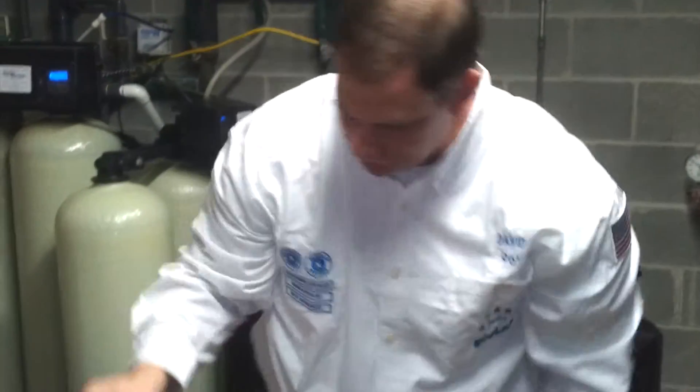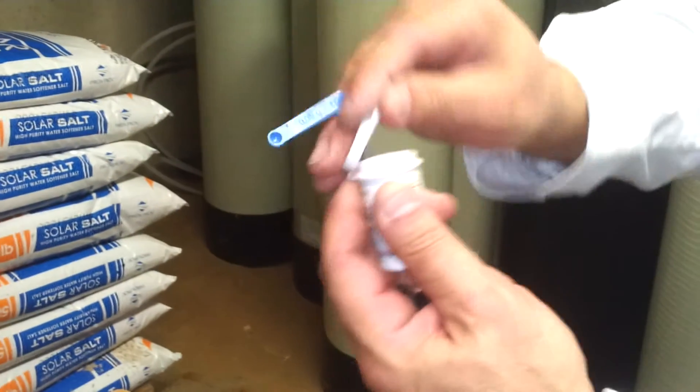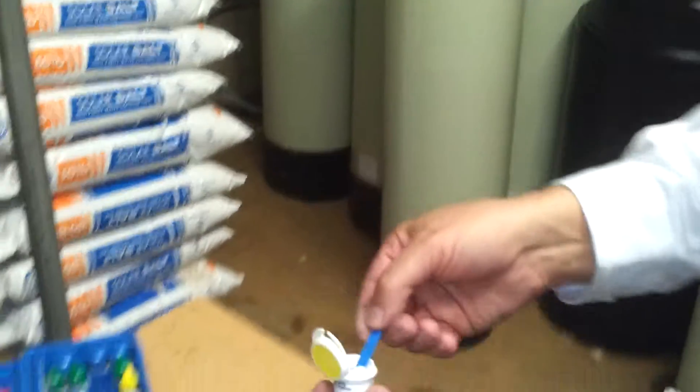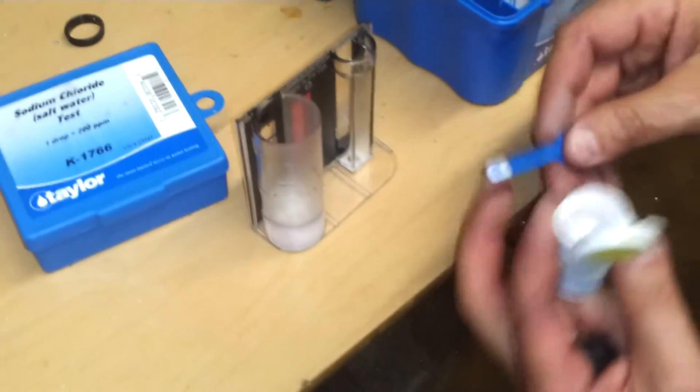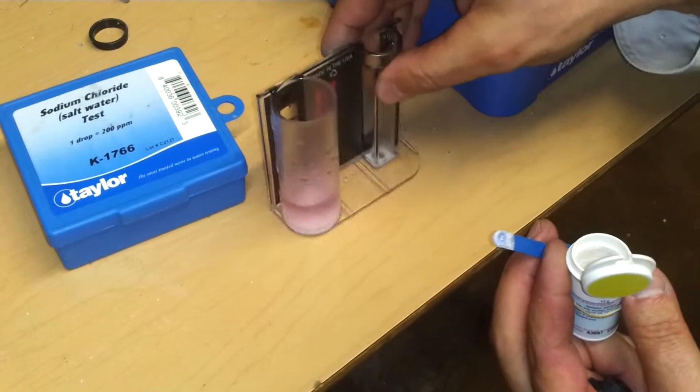Then what we're going to do is take our vial of DPD powder. That is the indicator that tells us if there's chlorine in the water. We take a heaping scoop of it and pour it in the sample. And if there's chlorine, it'll take a tint of pink.